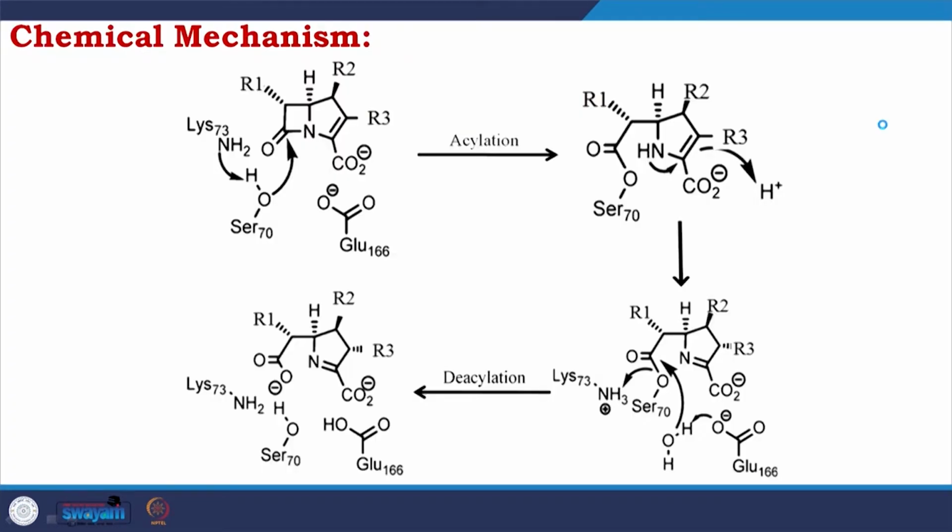Now, in this demonstration I am talking about tuberculosis beta-lactamase, which is a class A. So, I am showing here the chemical mechanism of how class A works. As I told, they work through the catalytic residue serine. When it attacks, another residue, the lysine, called the secondary catalytic residue, takes the proton, making its O negative, so it attacks.